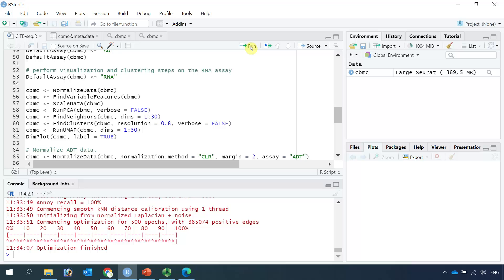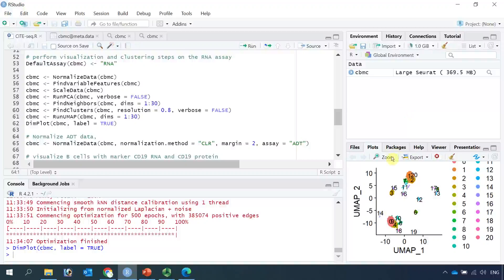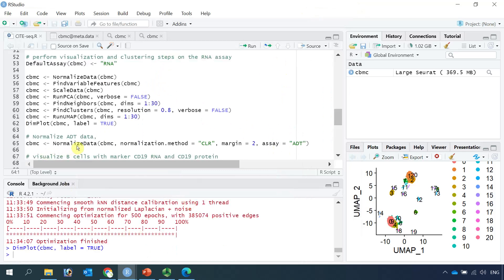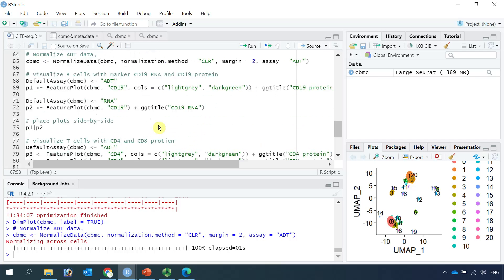Now we are ready to see the cell clusters using the DimPlot function. Let's zoom in — you can see we have 21 cell clusters with resolution 0.8. Next, we can normalize the data for the ADT assay. Let's run this code to normalize the ADT data. Now we are ready to visualize the cell clusters for both ADT and RNA. To see the antibody information, we need to set the default assay as ADT.